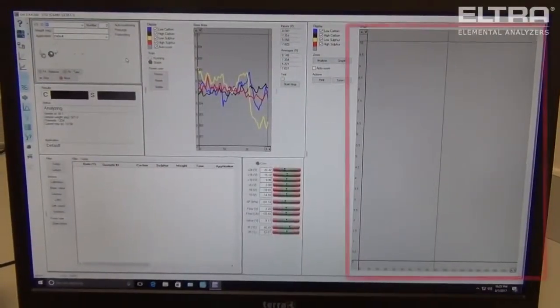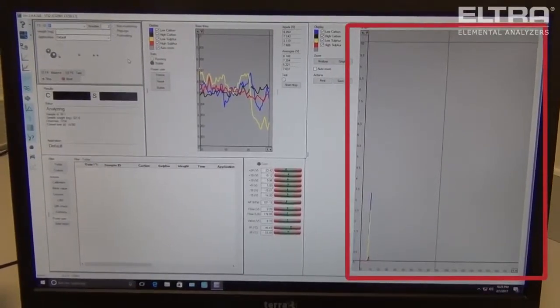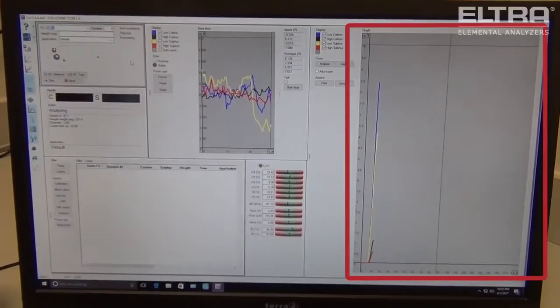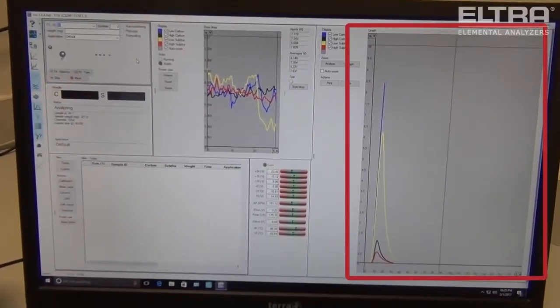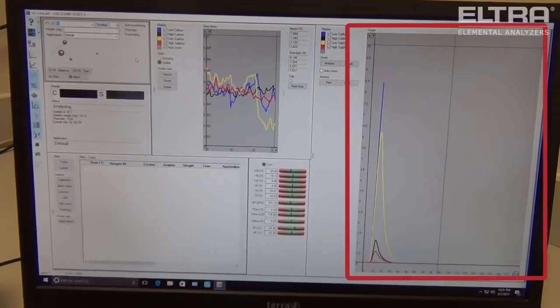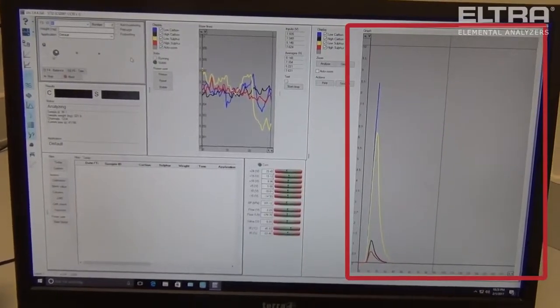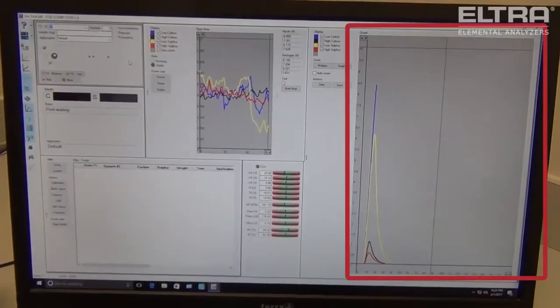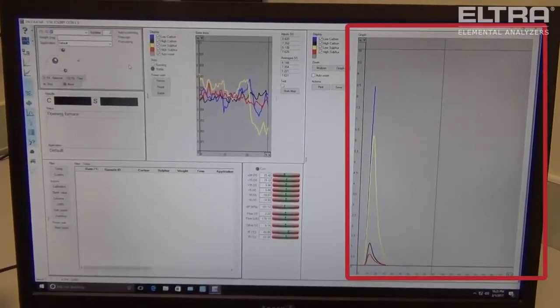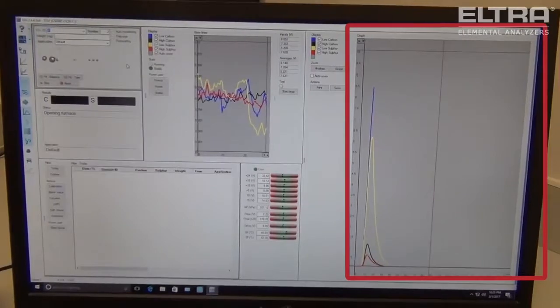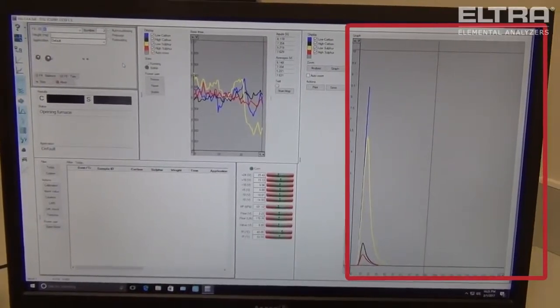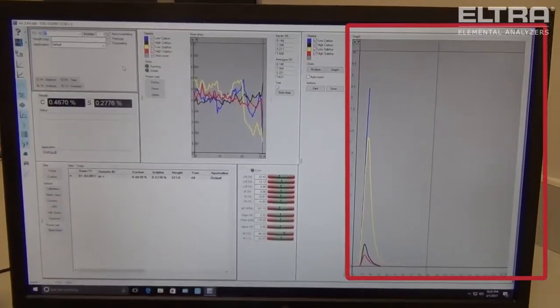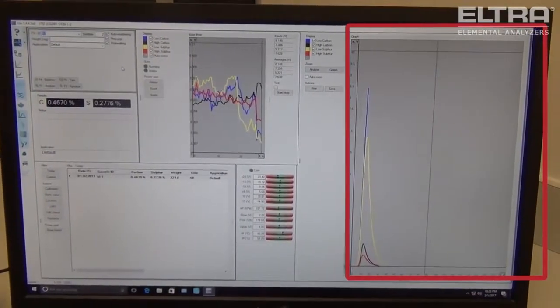On the graph to the right, you can see in real time the results of your analysis. As you can see, each peak is represented by a different color. Each color represents the certain IR channel to which the sample is being introduced. The blue line you see tops out at a maximum of 8.5 volts, which we have set up in the system. The system automatically knows to send that sample to the high carbon channel, which is represented by the black peak.